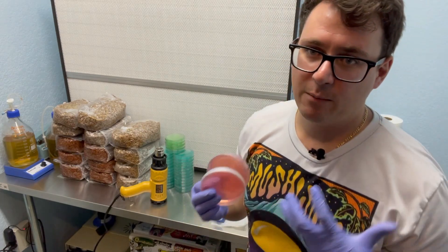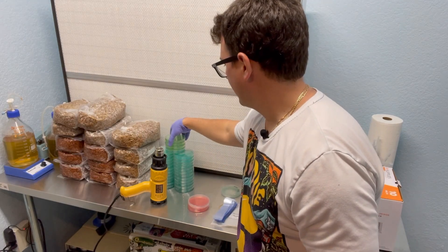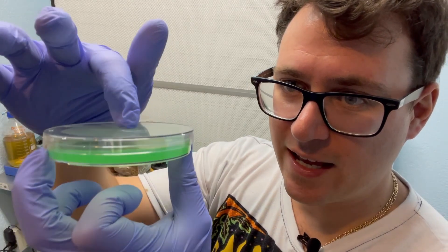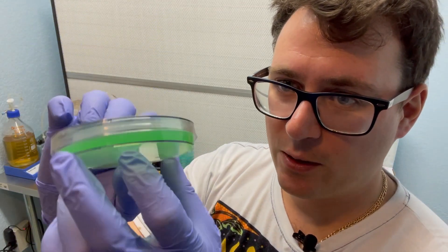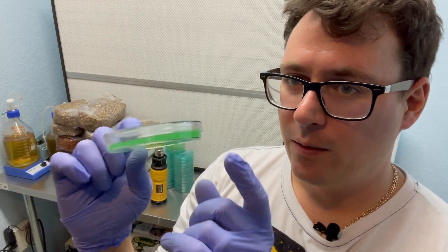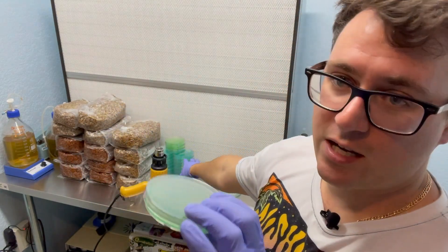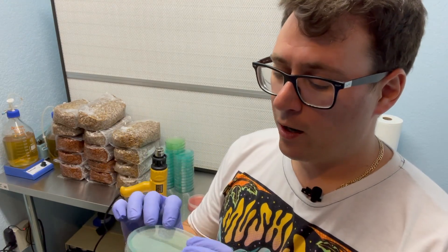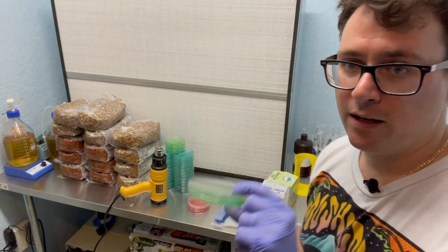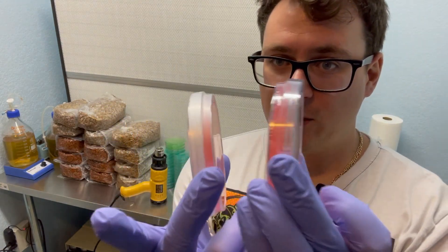So what are the main objectives for sealing a petri dish? If you grab a petri dish without parafilm or shrink wrap, it's just a dish with a loosely fitted lid. It contains agar, which is used to grow mushrooms on. After you do your transfers, or if you are storing petri dishes and you don't want them to dry out, or if you want to protect them while transporting them from the incubator to the workstation, it's always a good idea to have some sort of a seal.